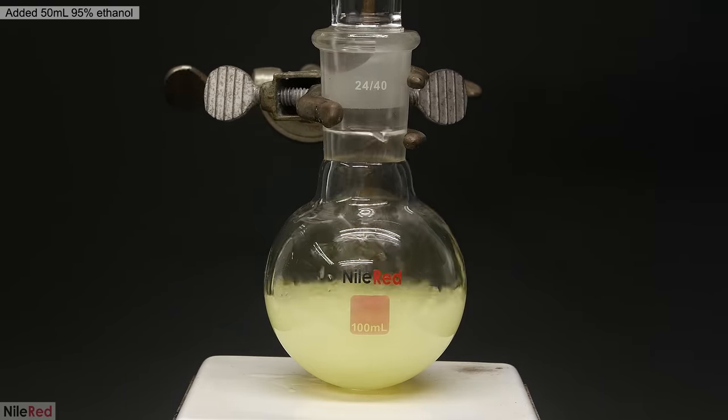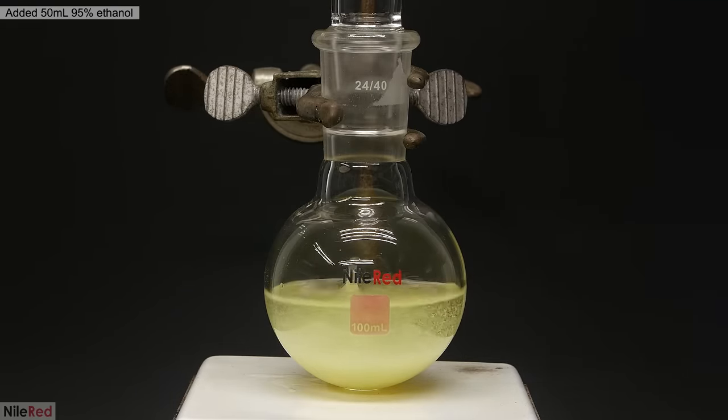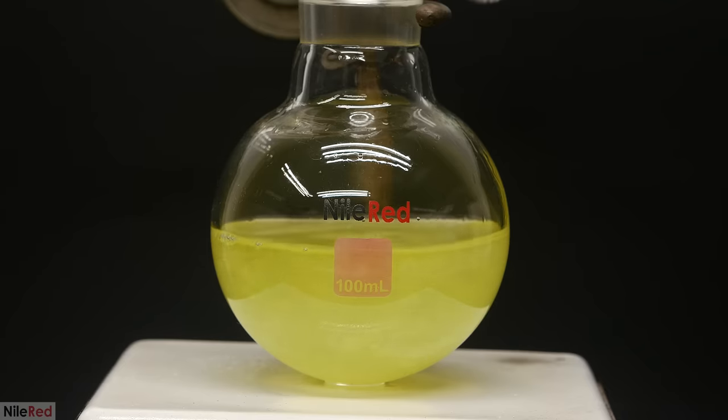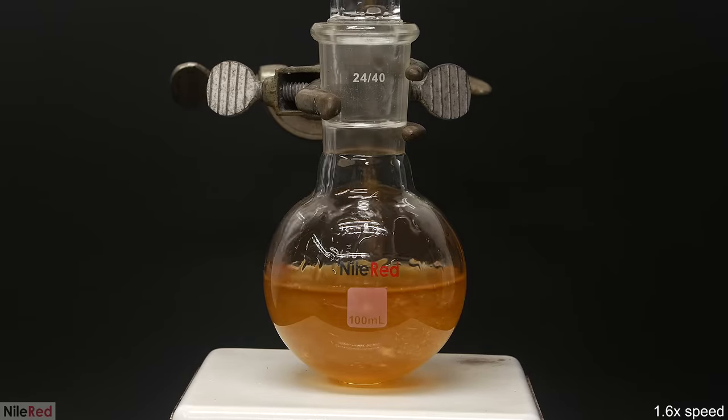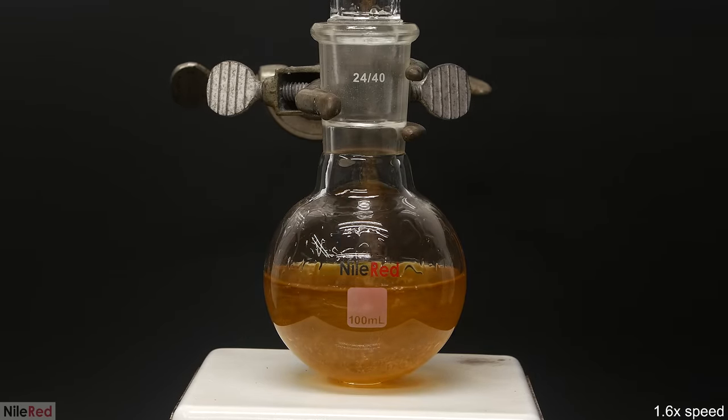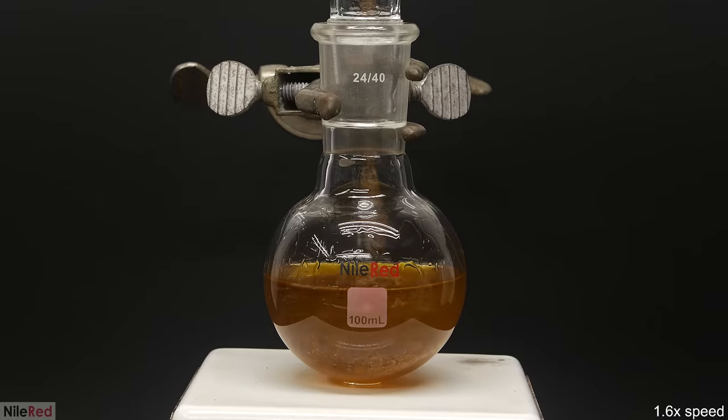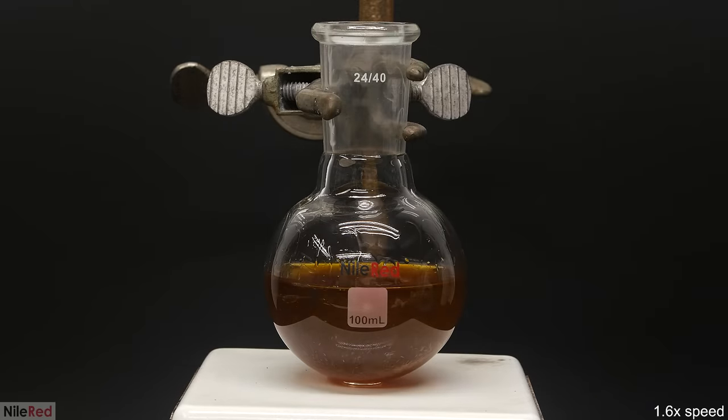Anyway, on top of this, I poured in 50 mils of 95% ethanol, and stirred it for a few minutes for things to dissolve. Then I added the concentrated potassium hydroxide solution that I made like a minute ago. It caused an immediate change in color, and a lot of the stuff that was still undissolved started to disappear.